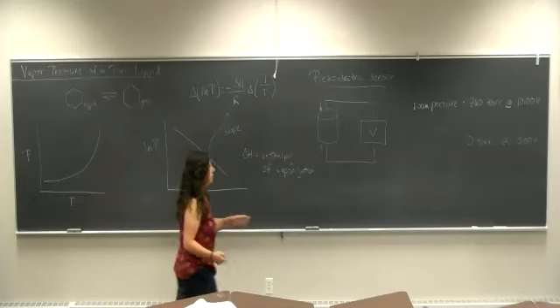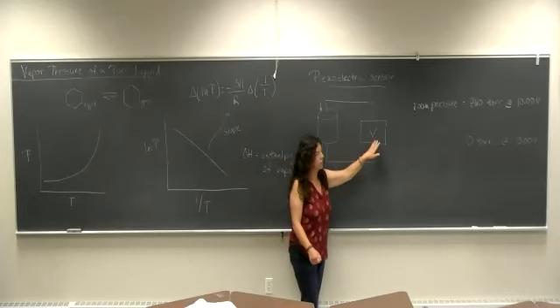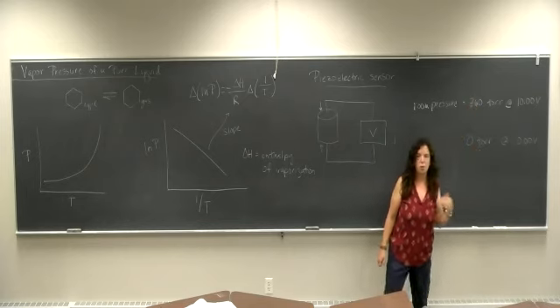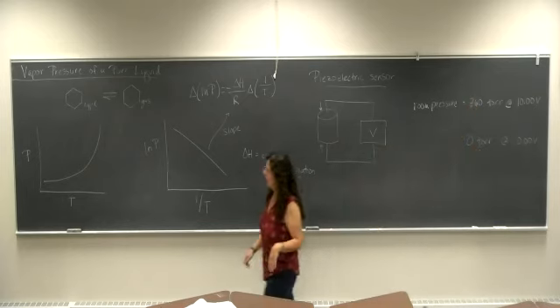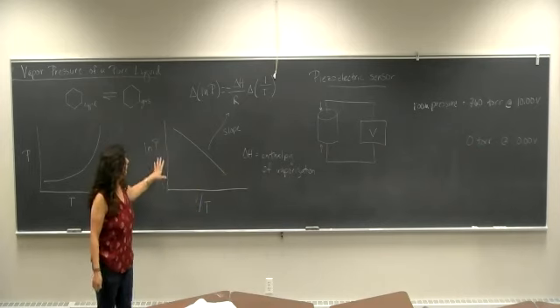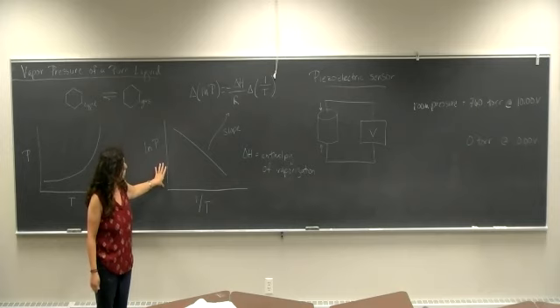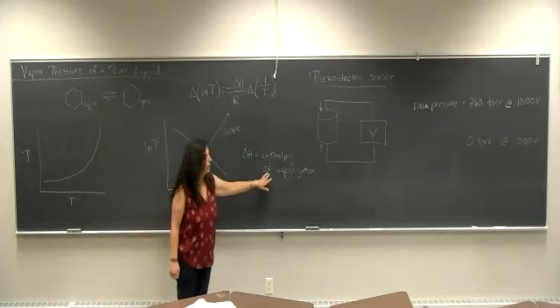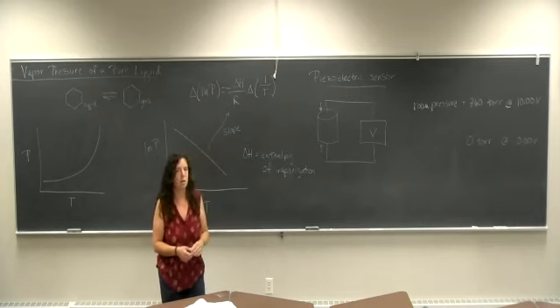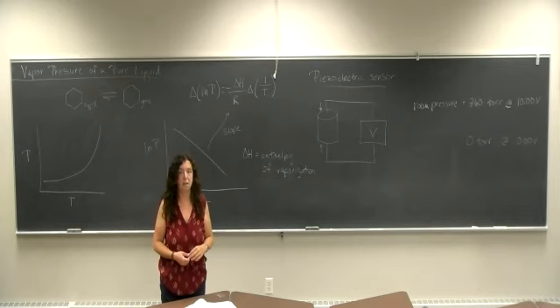So you will be collecting this as a voltage. You will use this information to convert your voltage to a pressure. So you can get a plot like this. Then you will process your data to obtain the linear relationship to get the slope, and then you'll calculate the enthalpy of vaporization using this line, and then you'll compare it to some literature data.